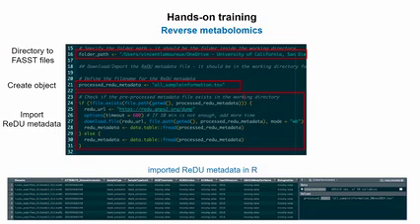The subfolder. You have a folder that you create, all on your desktop. Let's say you call it workshop. You will define the subfolder. Yeah, so you create a subfolder called the path, right?